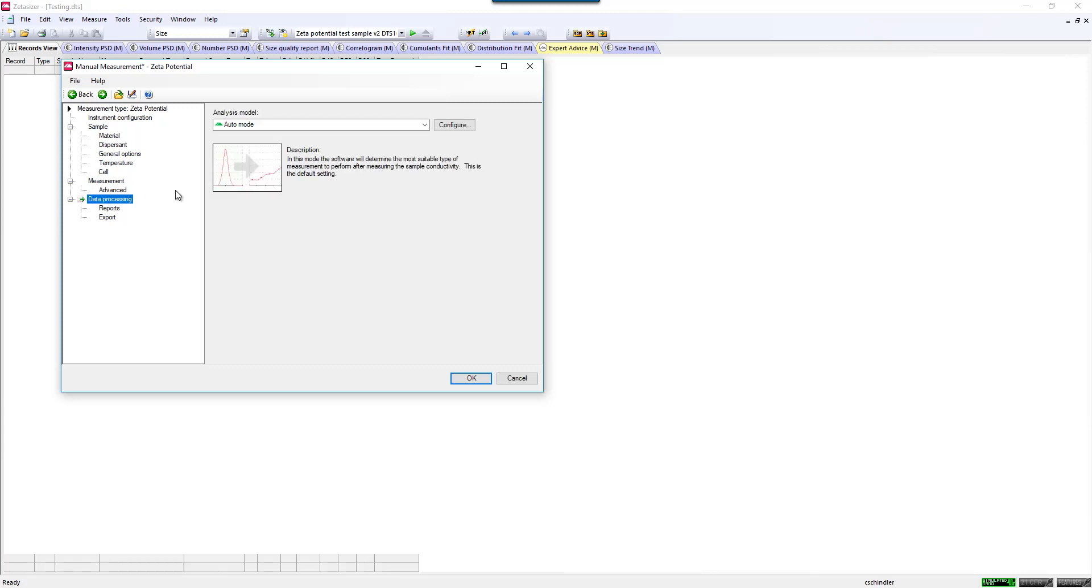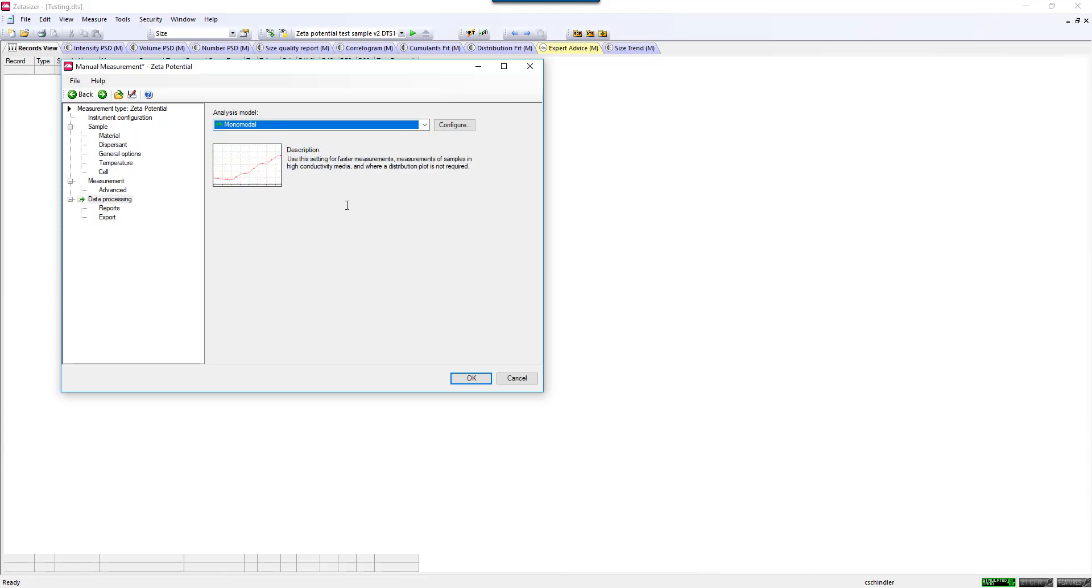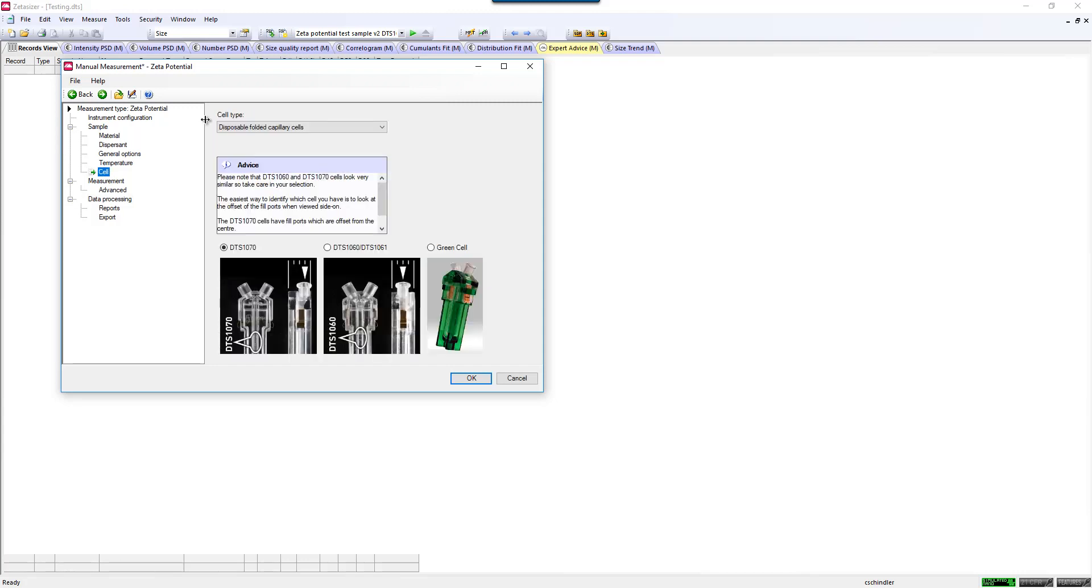There are many different types of data processing modes. There's auto mode, which means the instrument will select, based on the conductivity of your solution, whether it will make just the mean zeta potential measurement or also do mean zeta potential measurement and zeta potential distribution. If your sample is fairly high conductivity, I would suggest selecting the monomodal measurement, which the instrument would do in automatic mode.